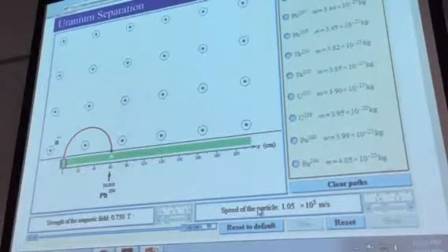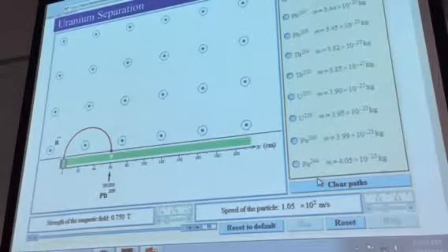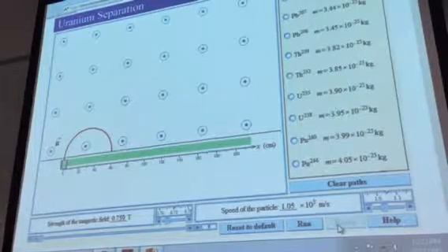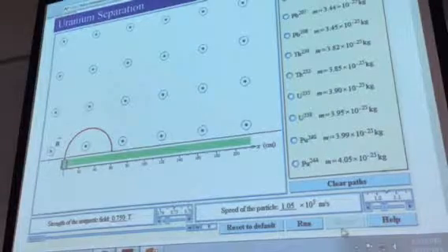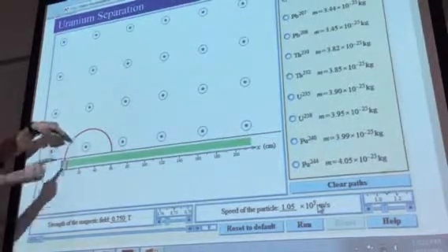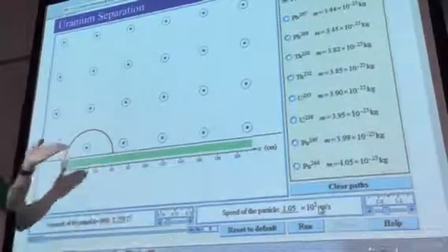The curves are going to trickle upward, right, with the mass? Say again? The curves are going to trickle upward, like when you drop a rock in the water, how it trickles up. The circles are going to trickle up, varying mass, right? Well, we certainly expect to see a different radius of curvature. Yes. Right? So right now there's a semicircle, that path is the simulator set up nice.